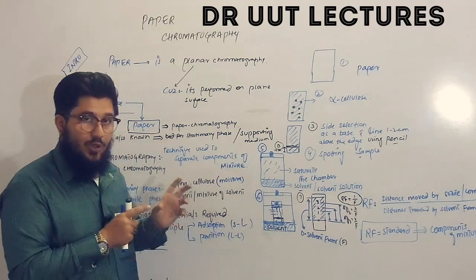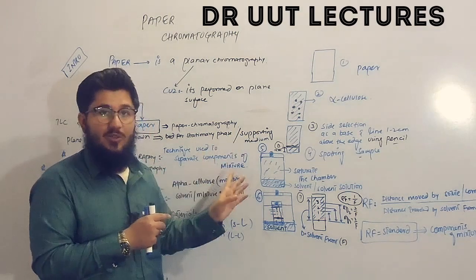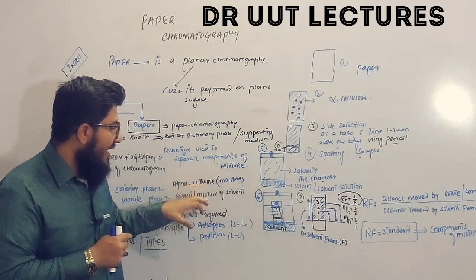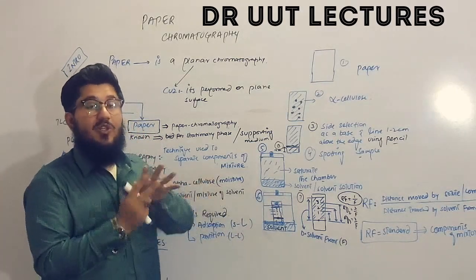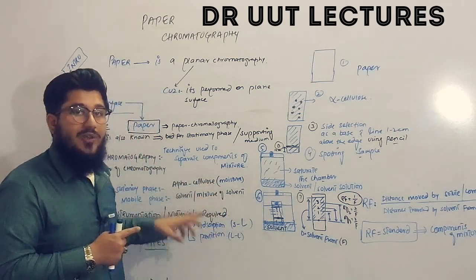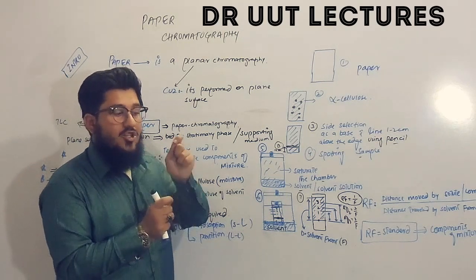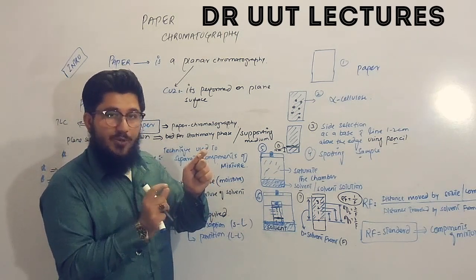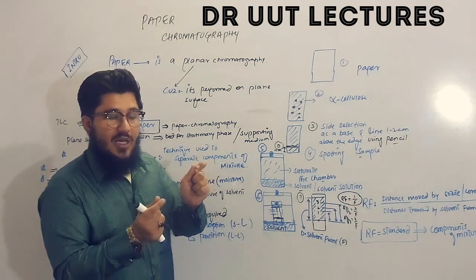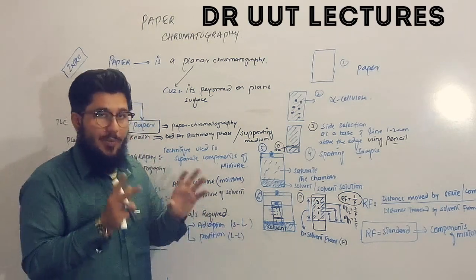And in case I told you that we can use a stationary phase other than this alpha cellulose, that might be a solid one. So if we are using a solid stationary phase and liquid mobile phase, then our principle will change. Then what will be the principle? Simple. That will be adsorption. So in that case, our sample is interacting with the liquid mobile phase and solid stationary phase. So if your component is separated by means of a liquid mobile phase and solid stationary phase, this type of separation is done by the principle that is adsorption. I hope it is clear now.